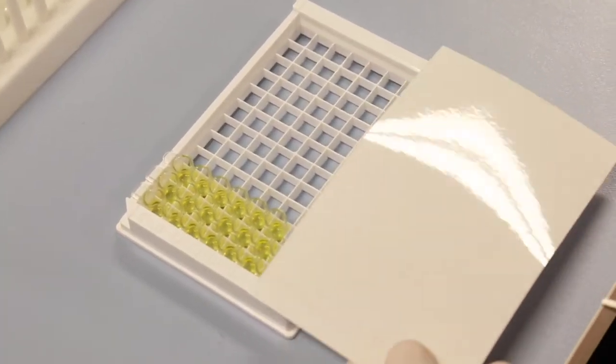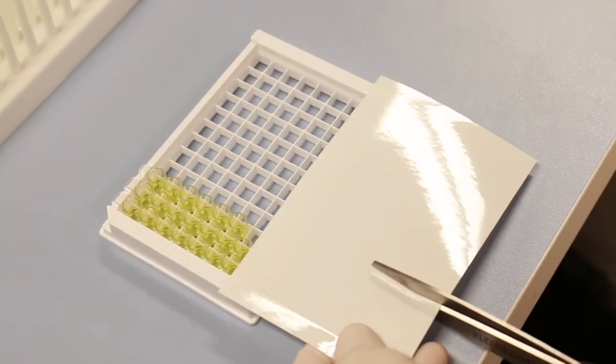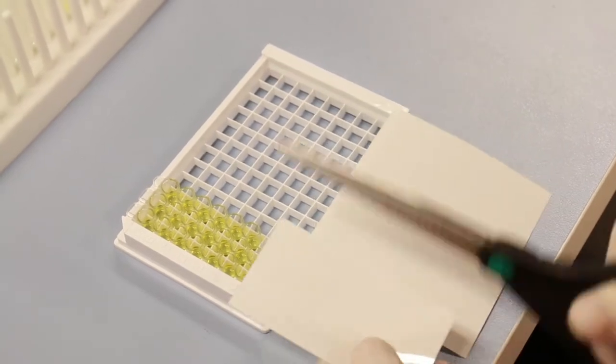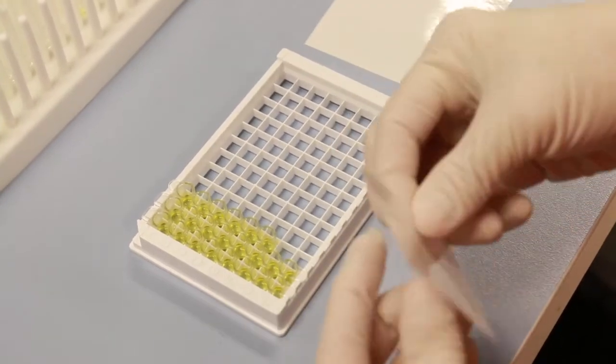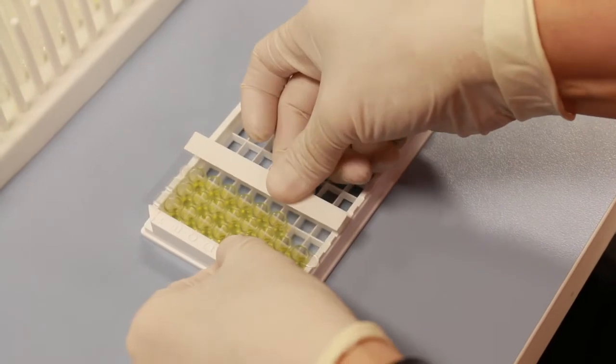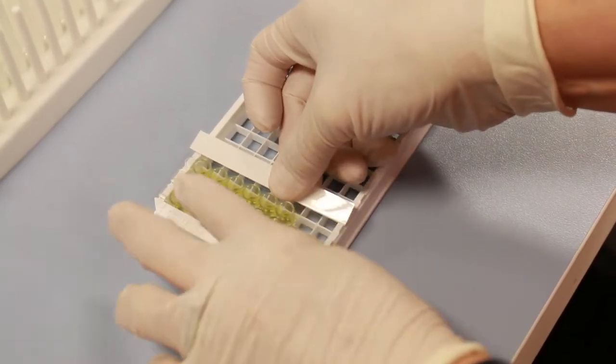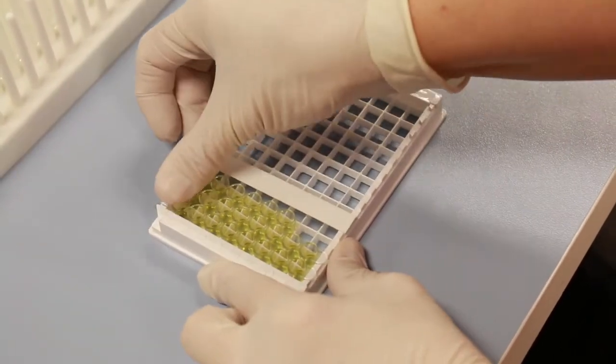If you are using part of a plate, we suggest cutting the plate sealer to fit the wells being used, and keep the unused part of the plate sealer for a later assay.